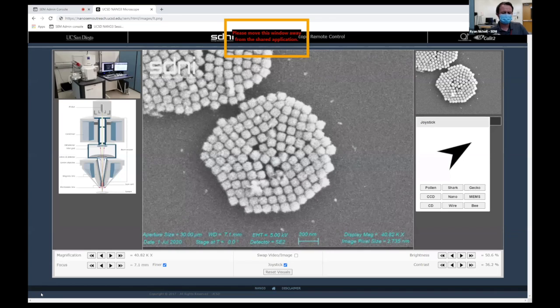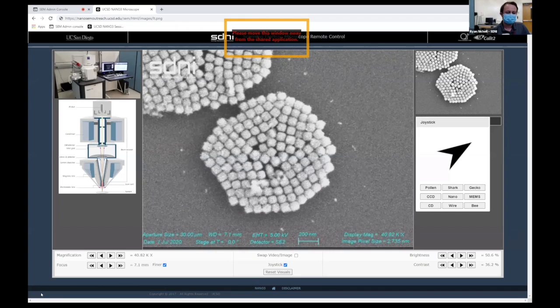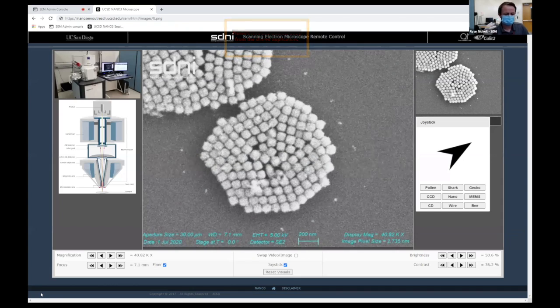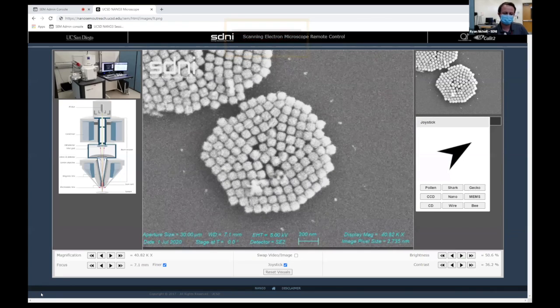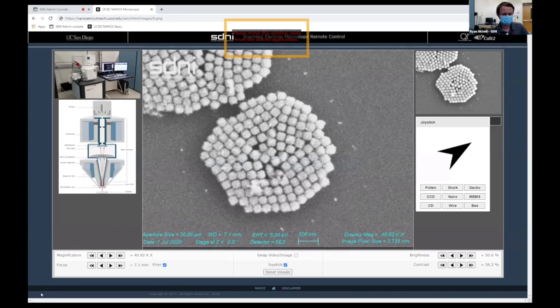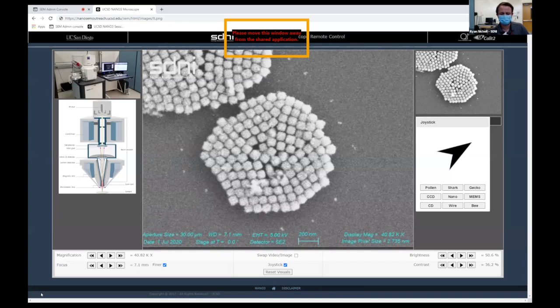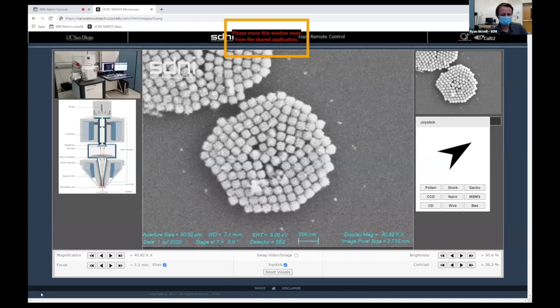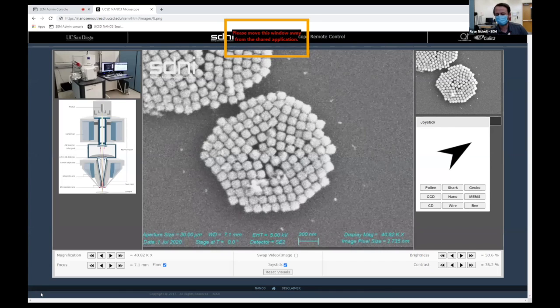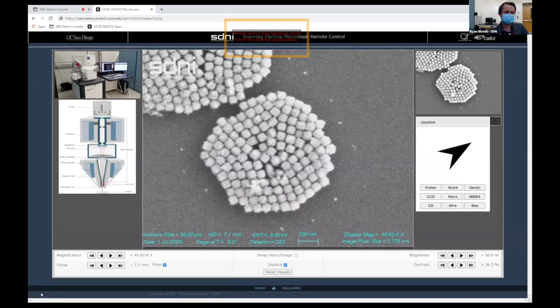In an electron microscope, what gives us the resolution? The resolution comes from the fact, broadly speaking, that electrons are really tiny. You might have heard about wave-particle duality, that electrons are actually wave-like, so you can associate a wavelength with them, just like you might associate light with a wavelength. For all practical purposes, though, the wavelength of an electron is so small compared to anything you'd ever want to see. So we're resolving nanometers here. An electron's wavelength in this system is on the order of picometers. So nanometers is 10 to the negative 9. Picometers is 10 to the negative 12.